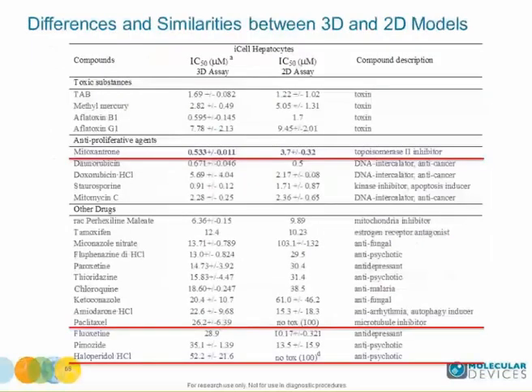Spheroid assay performance was characterized using a representative set of 48 compounds that included some known cytotoxic and hepatotoxic agents and also 6 chemicals considered safe or non-toxic. The table represents IC50s for different classes of hepatotoxic compounds, which include known liver toxins, anti-cancer drugs, antidepressants, and several other types of drugs. We compared IC50s for 3D cultures and 2D cultures.